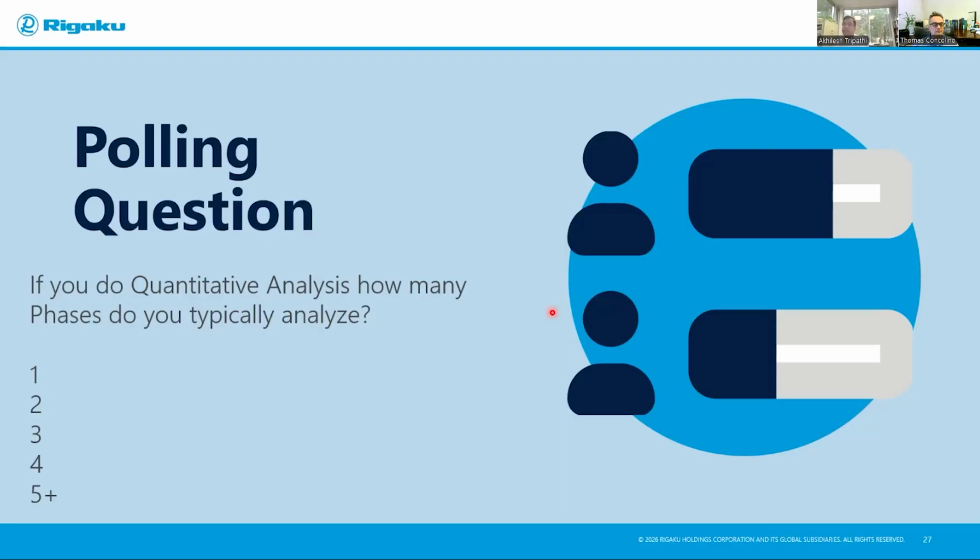Second, the reason why an internal standard is superior, like I mentioned briefly in the earlier slide, and I actually use it sometimes for cement amorphous, is that I add zinc oxide to calibrate the quantitative result. So I was saying, make sure the peaks are not overlapping. And secondly, the internal standard provides you the corrections internally. If you are adding 10% zinc oxide, then it gives the amorphous amount as a correct number, because you have one component of your phase exactly known to you.